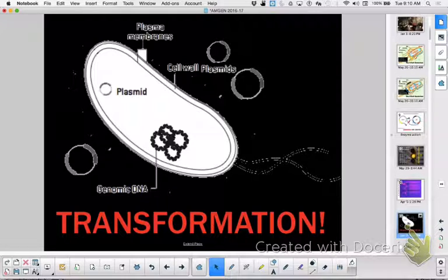So when this lab was first started 25 plus years ago, when we first did this lab, the only thing we gave them was antibiotic resistance. That was the culminating part of the lab. And we did that for years.